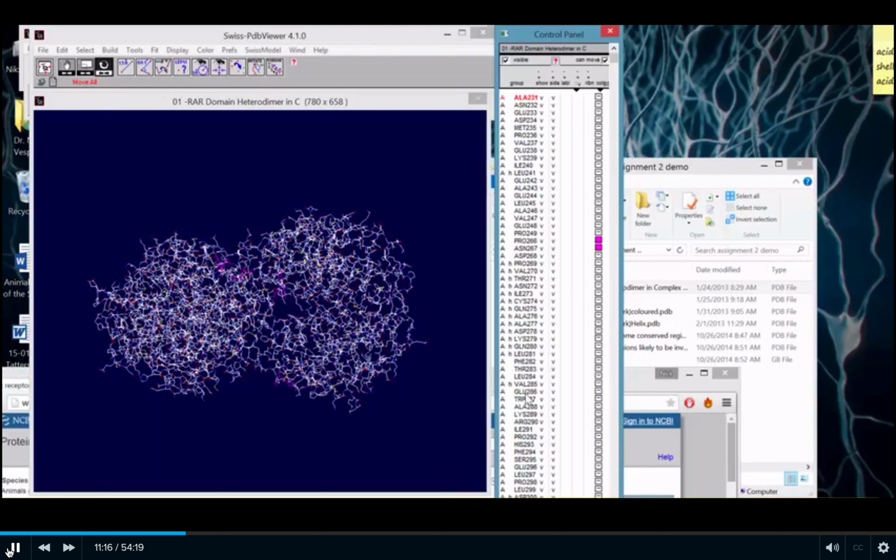So it's simply a section of the protein that was found on our CSP, which makes sense because we've got a ligand binding domain, so that's great. But this tells us specific residues. And again, later on, once you start to use the tools, you can select different residues here with regards to the red text and do different things to them. The first column after that, actually, sorry, I apologize, I kind of missed a column here.